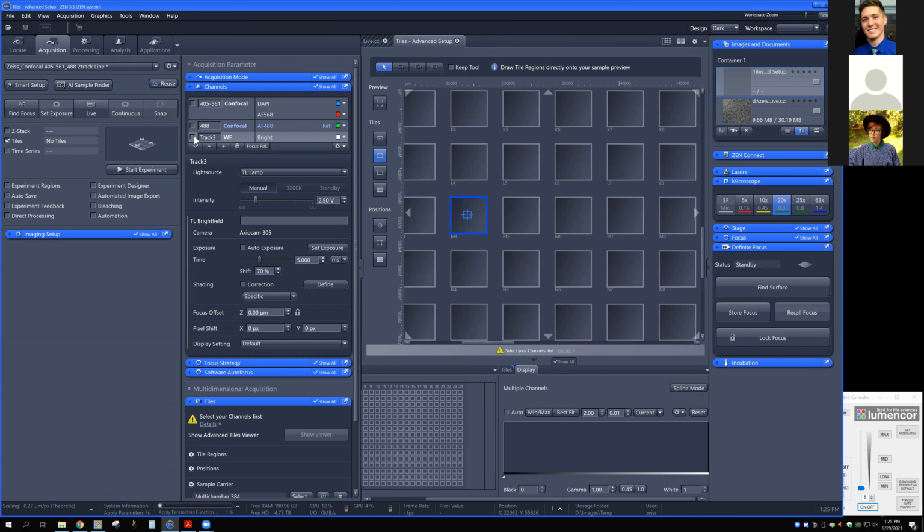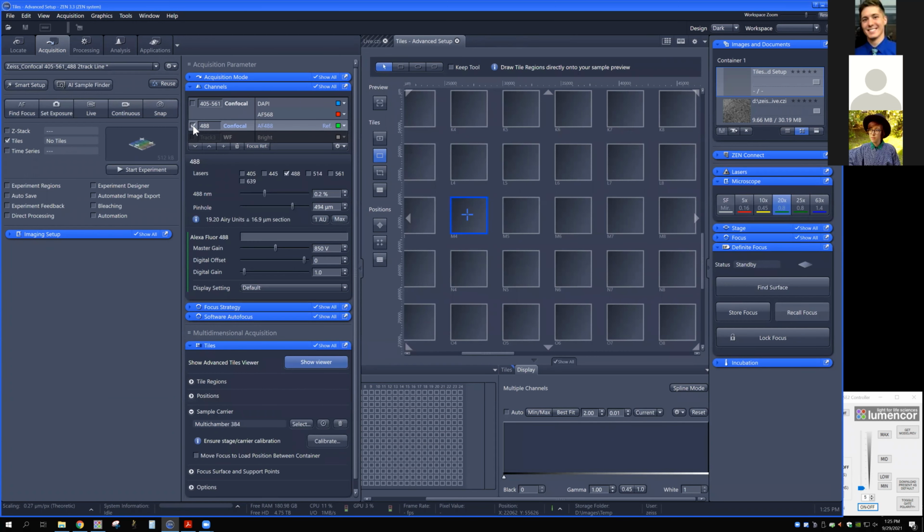Well, we can continue playing with this to try to optimize it as we keep on going. But I'll give it one more try here with the 20, and if we need to, then I might just talk about tiling in the context of setting everything up and working with Zen and the tools, and then we can spend time trying to optimize as part of the sample run.